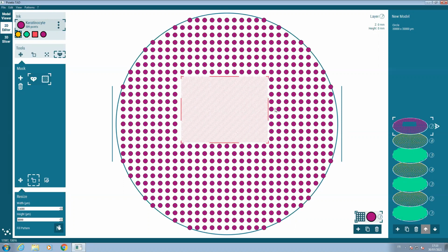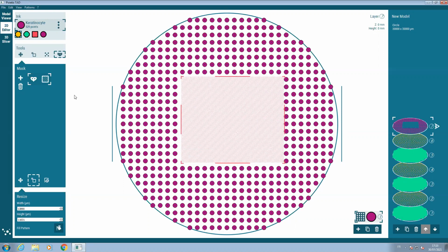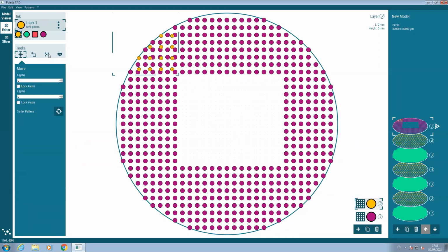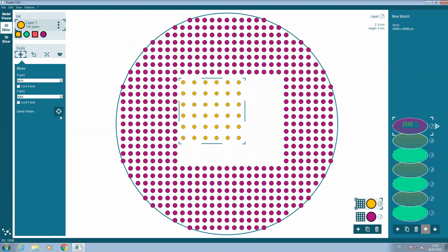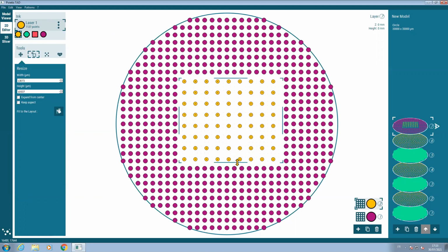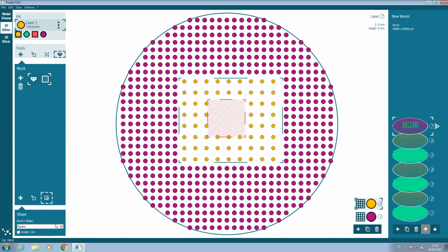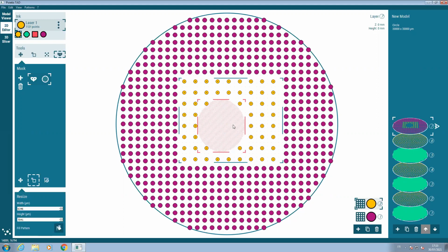And here again, if you want to print different cell type, you can do that like this. So it's really easy, it's really fast. And then, of course, you can resize and you can repeat it many times. You can add as many cell types as you want. And again, if you want to add another mask, you can do that. Here, there are different kinds of masks. So this is a square one, but you can also use a circle. So it really depends on the kind of application that you want. And you can, of course, resize this mask.